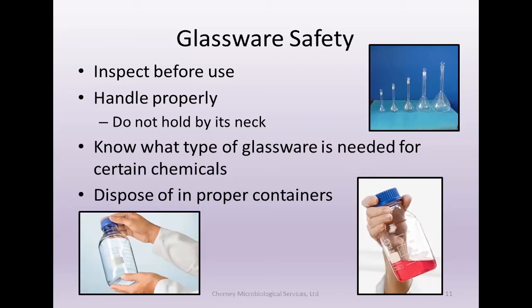As far as glassware safety in the lab, I can speak to this because I've been in a couple labs where I've seen technicians swirling melted media bottles as pictured in the bottom right, and they're looking for unmelted agar chunks. So they'll hold it up to the light and swirl it.